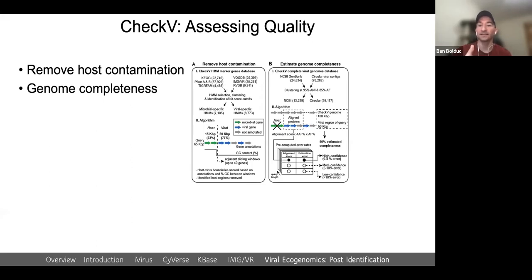Let's say that's a 70% completion rate, or they estimate the genome to be 70% complete. Now, this isn't perfect, but it does get you broadly to some meaningful measure of completion. If you have high confidence, you might have 70%, medium confidence, 50%, because in practice, as exceptional as viruses are, they usually have a couple of viral hallmark genes. And if you've mostly assembled them, they should mostly include those genes.